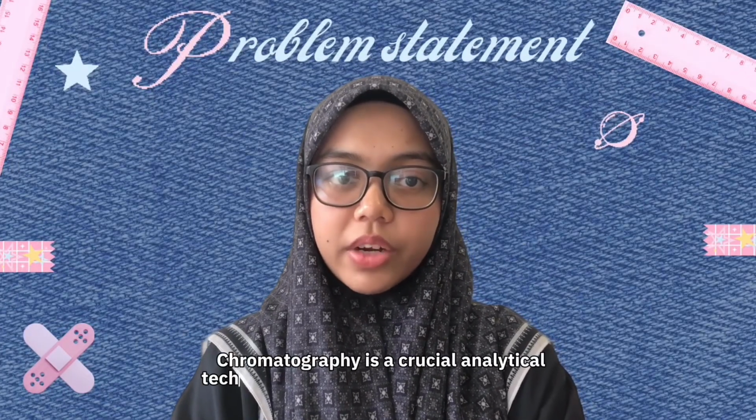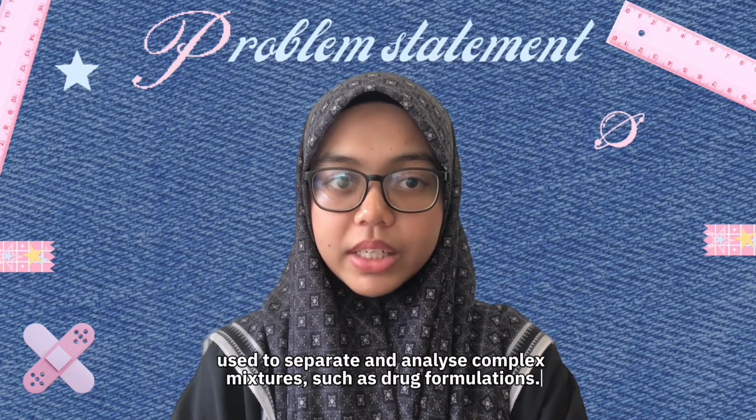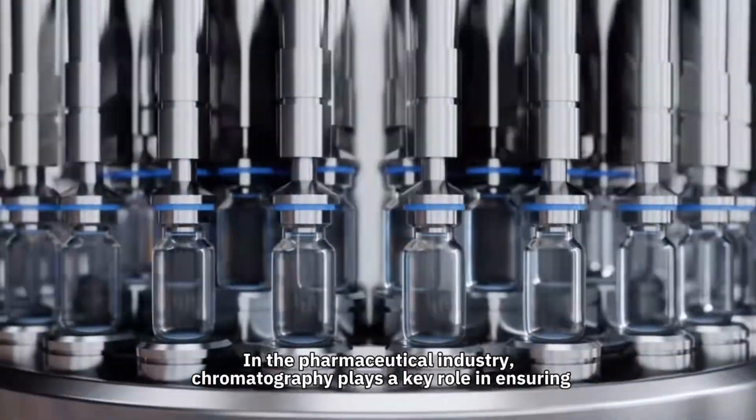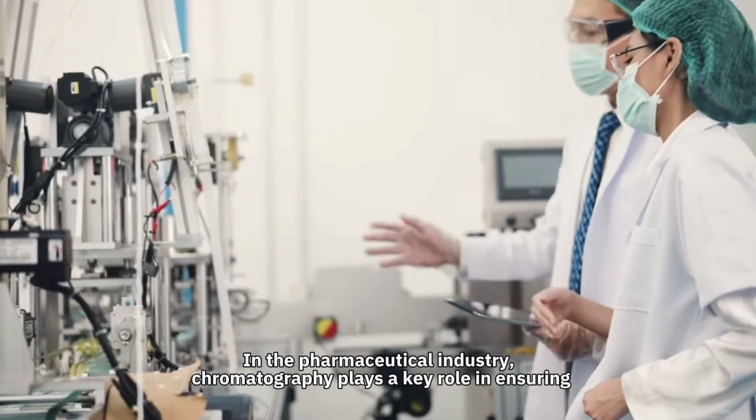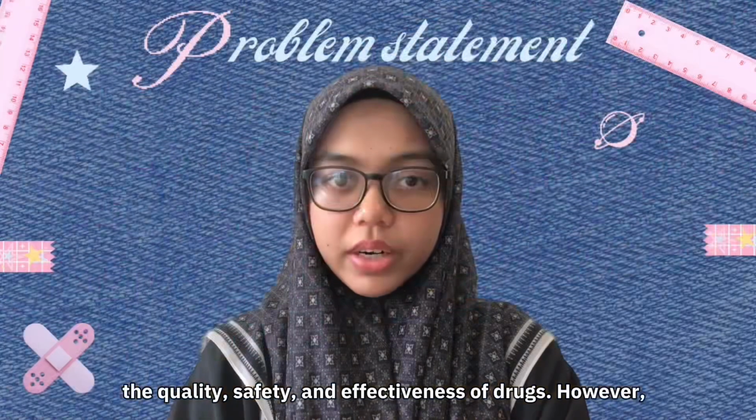For the problem statement, chromatography is a crucial analytical technique in the pharmaceutical industry used to separate and analyze complex mixtures such as drug formulations. In the pharmaceutical industry, chromatography plays a key role in ensuring the quality, safety, and effectiveness of drugs.